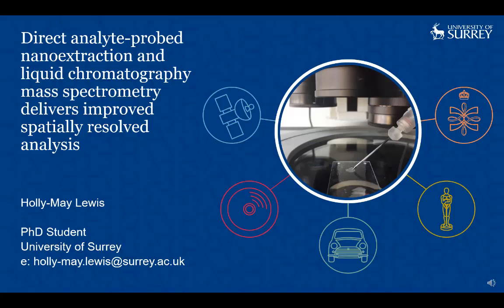I've been optimising a spatially resolved extraction technique called direct analyte-probed nanoextraction, also known as DAPNe, which I've combined with liquid chromatography to analyse discrete areas of a sample. This presentation discusses how the technique can be combined with IBA to gain both elemental and molecular information.